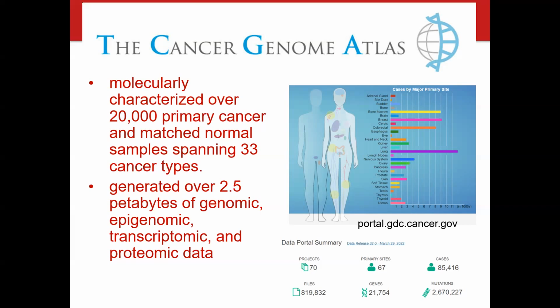It has very rich phenotype information associated with each one of these cancer types. So there's a lot of information about cancer stage and what types of treatments they've had, and many things that you can use in your differential expression analysis.